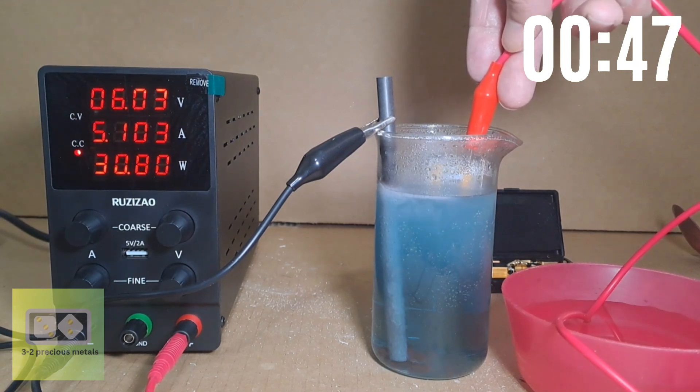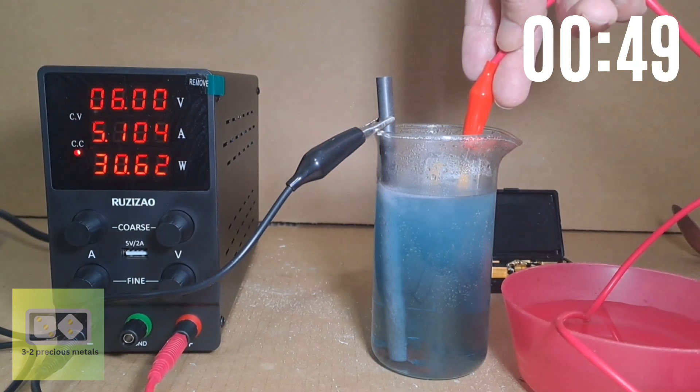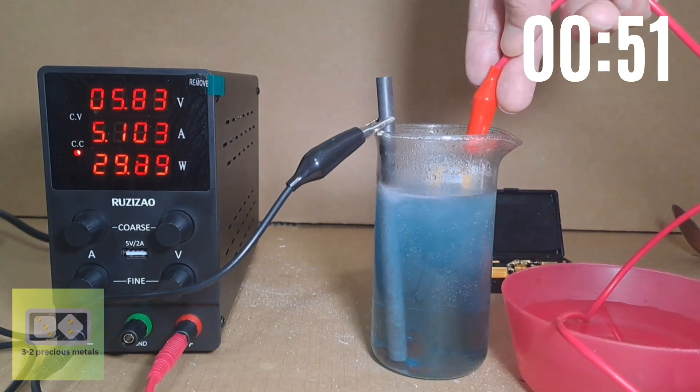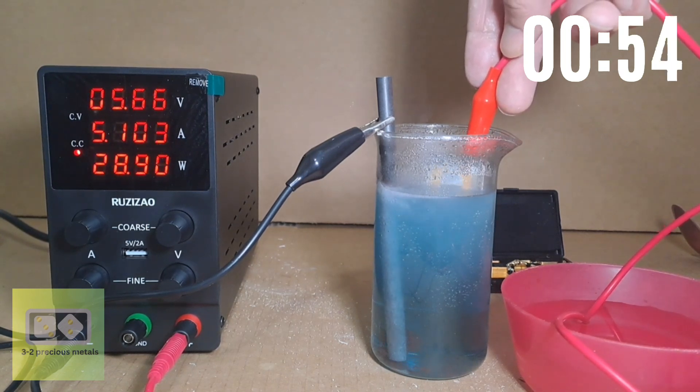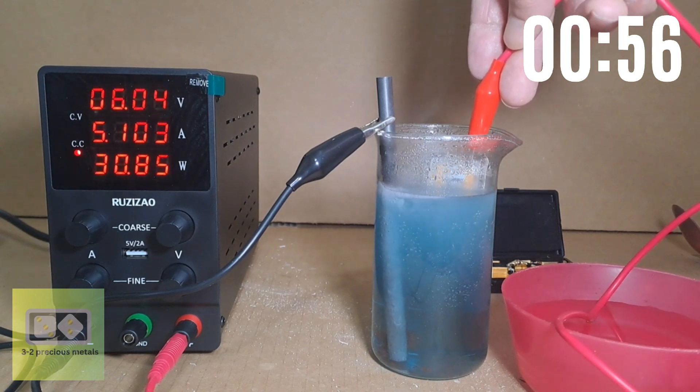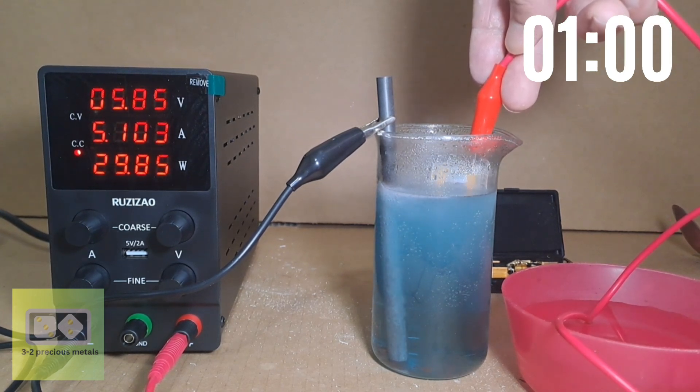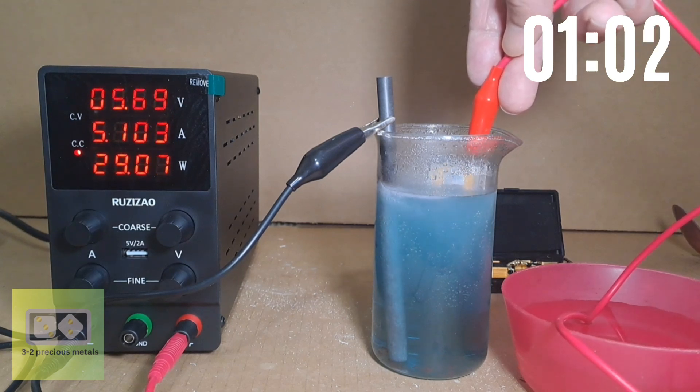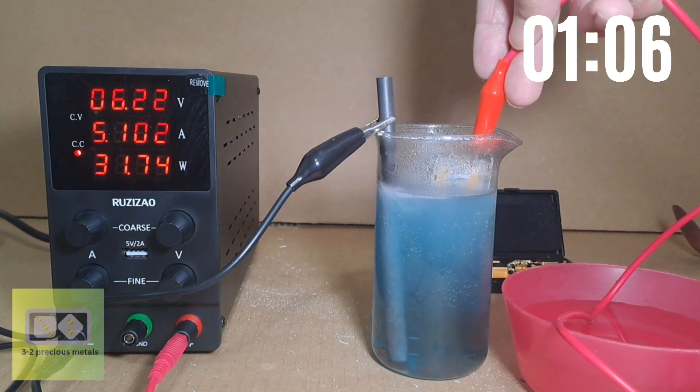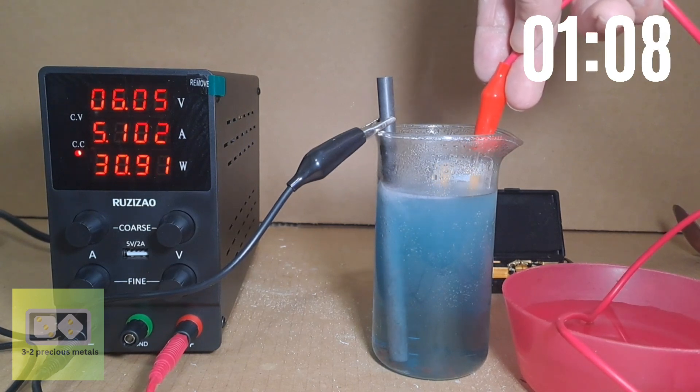For the electrolyte I have dissolved 80 grams of sodium bisulfate into 200 milliliters of distilled water. I also have a small bowl there of water with a teaspoon of sodium bicarbonate in it. This is to rinse the anode once it's done. This is used to neutralize the acid on the anode and prevent the acid from irritating my skin.